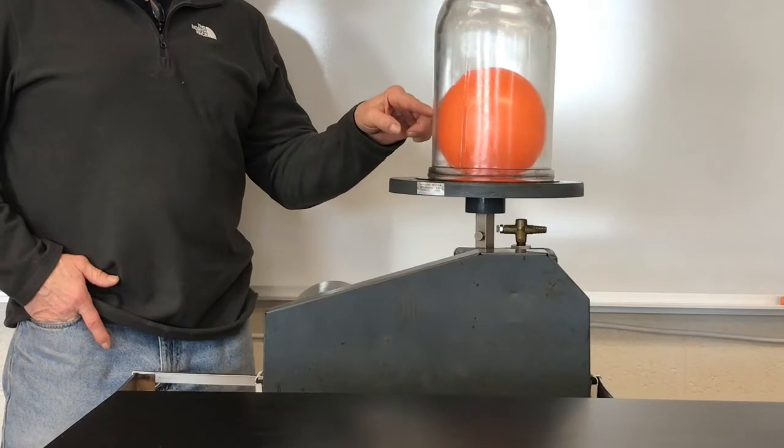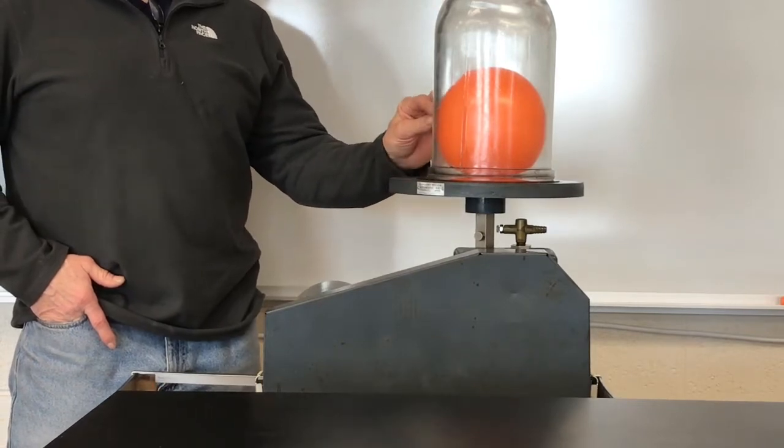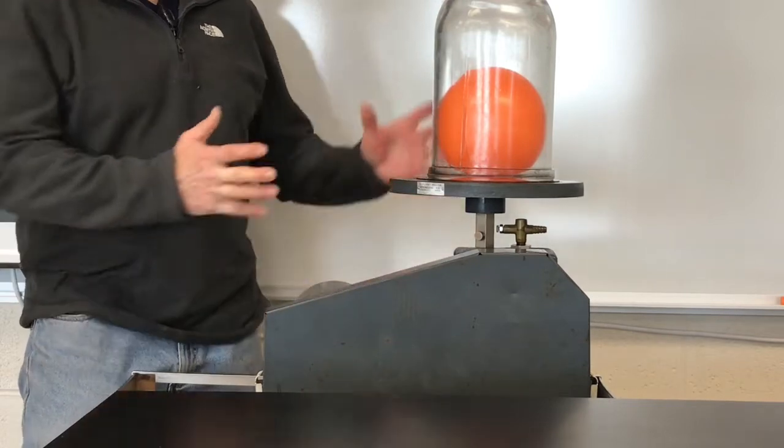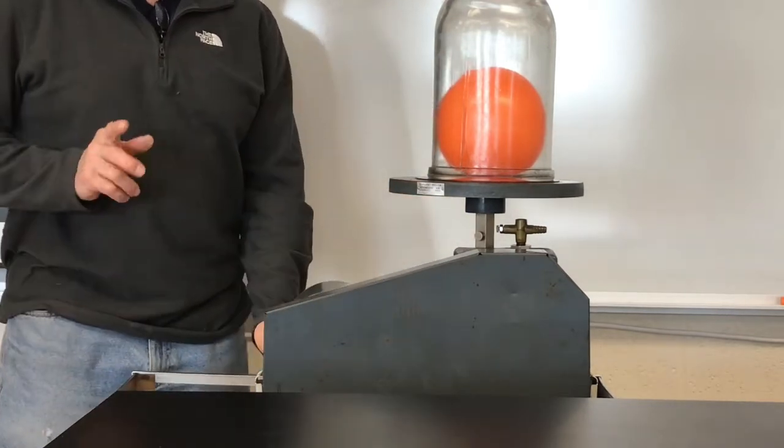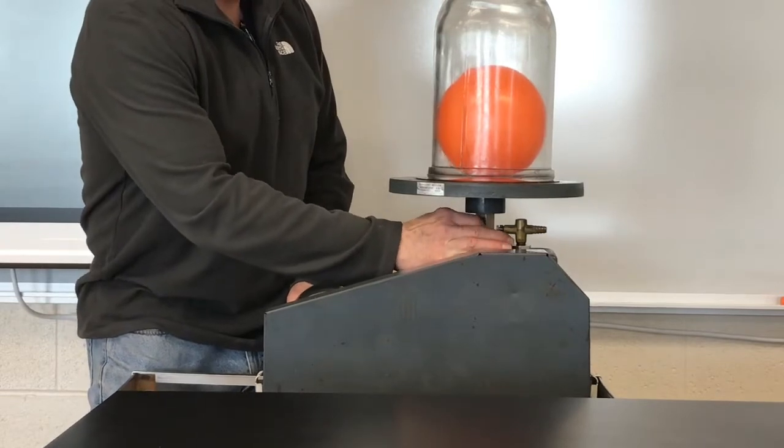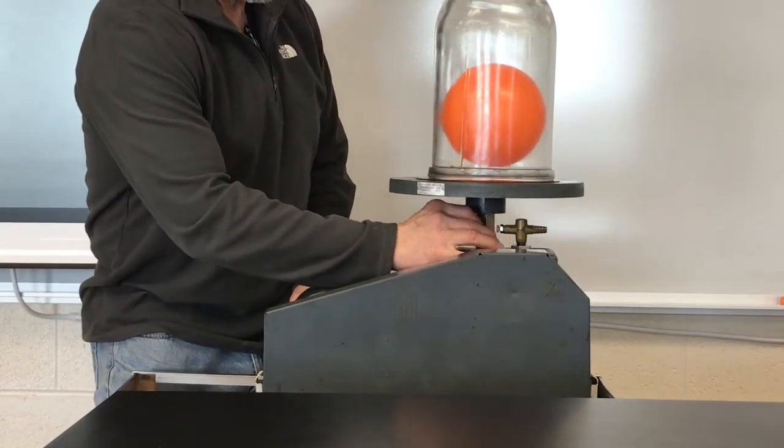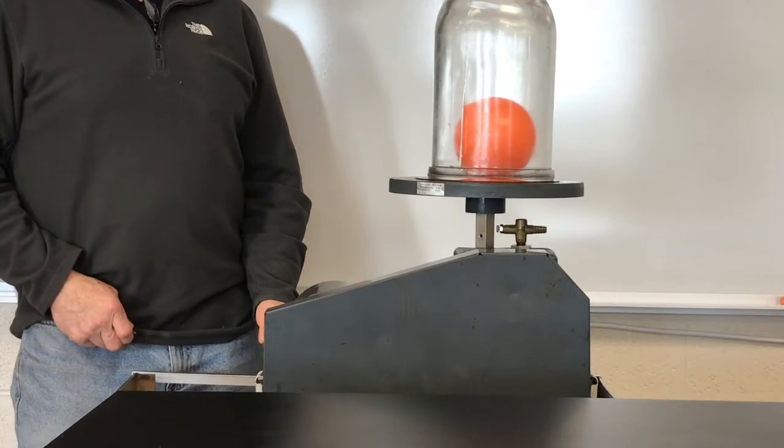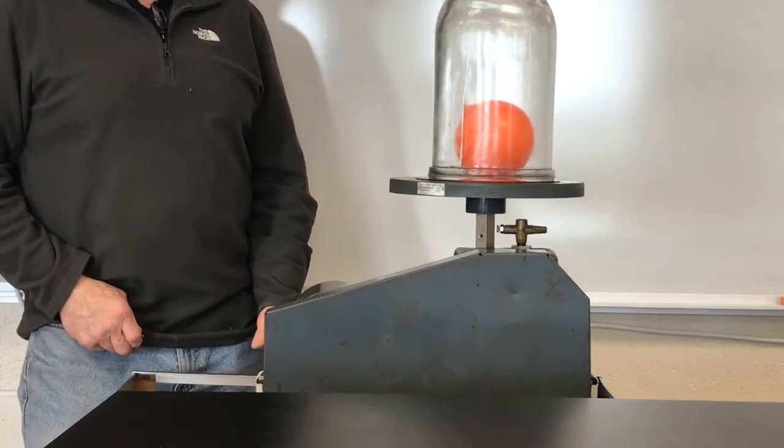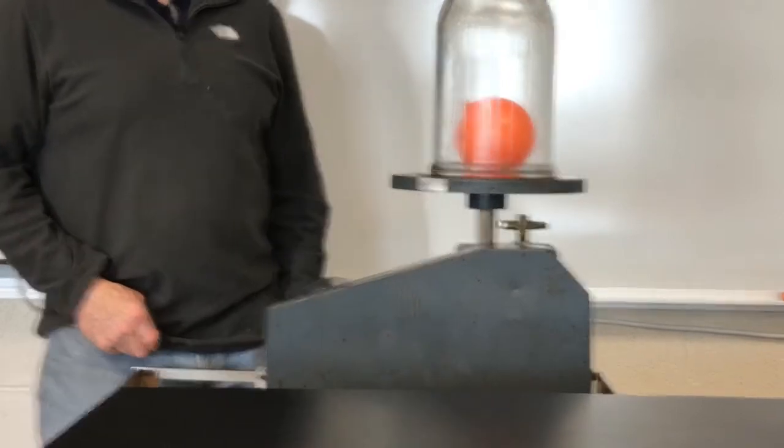We may have the problem now that the balloon has fallen to the bottom and it's plugging the hole. And so we may not really be pulling any more air out, but hopefully you saw the volume change. Now watch this. I'm going to turn the pump off and I'm going to let the air back in. And we let the air back in and the pressure resumes to normal inside there and it blooms back to original size.